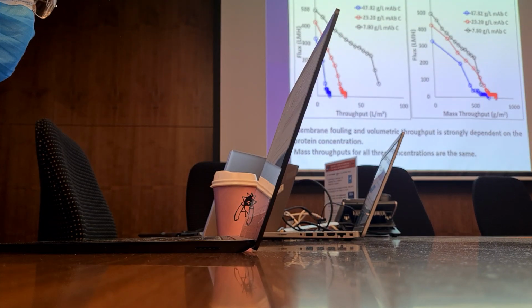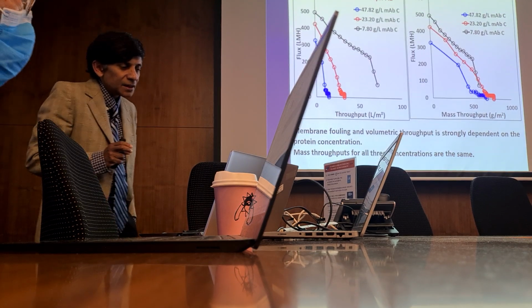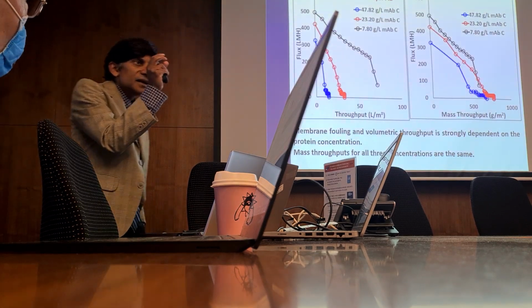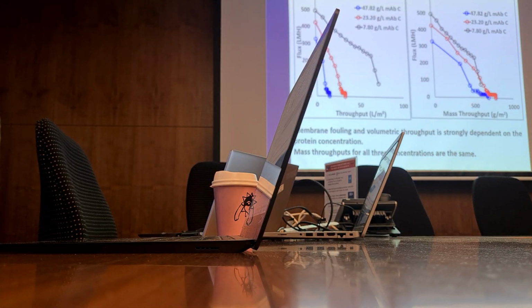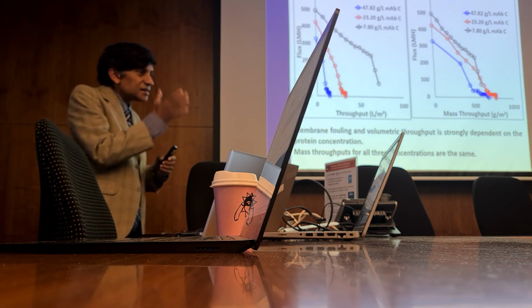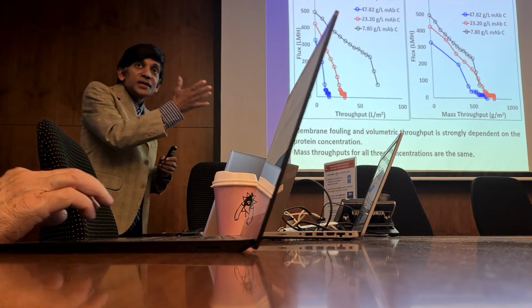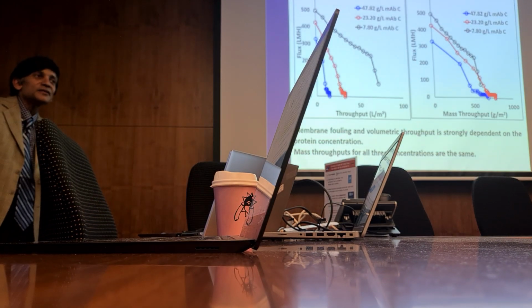So one study I thought I'd show you quickly, and this is for batch processing, which I showed you earlier, is that you saw at the very end, the virus filtration occurs at the end, but then there's an ultrafiltration diafiltration step. It'd be nice to eliminate that UFDF step. Why can't we just run through the virus filter? After all, it is a very tight pore size membrane. What you get out of the virus filter is very pure. Why can't we run that directly into formulation?